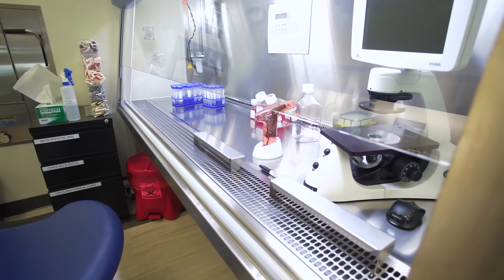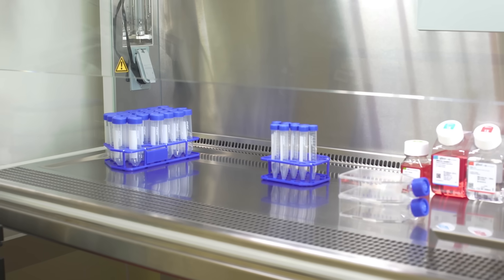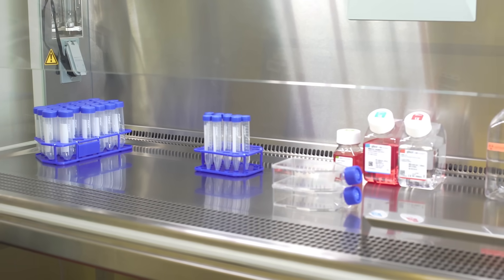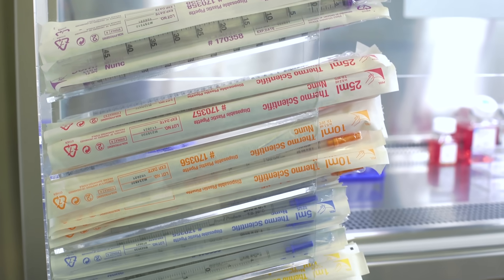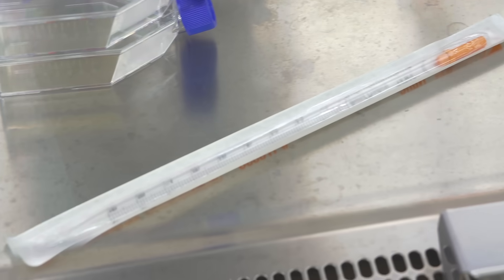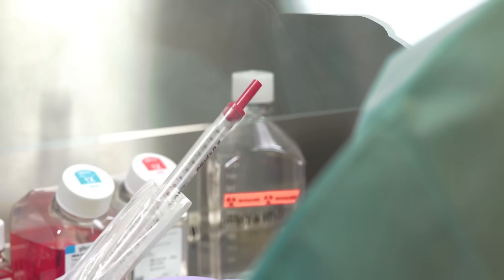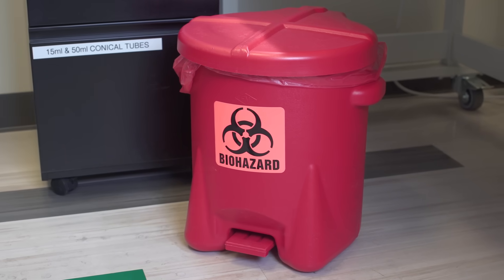The hood provides a sterile environment to work with your cells without fear of contamination. Always open your cell culture dishes and reagent bottles in a sterile environment. Outside the cell culture hood, keep a stack of disposable pipettes nearby. Pipettes are placed in the hood during use and only opened inside the sterile field. Have the trash, biohazard bin, and sharps container close by.